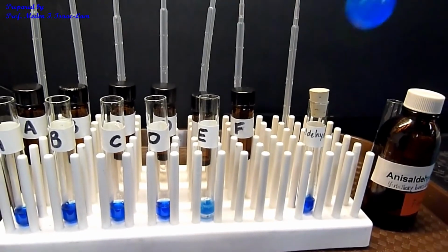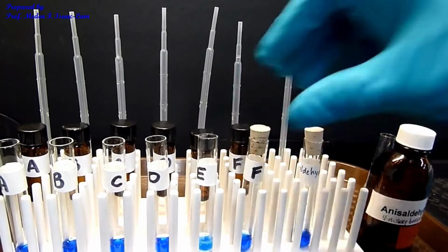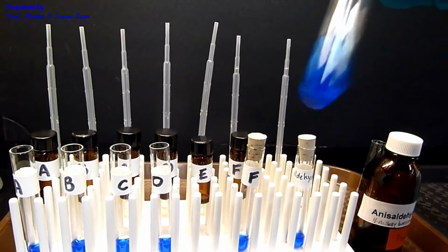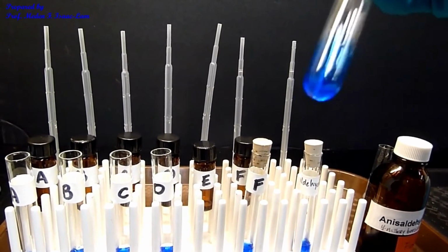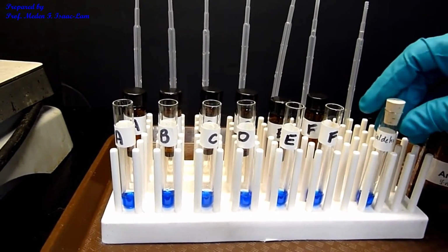If I shake it, it becomes almost purple. Very nice blue color. So this is for the standard anisaldehyde.